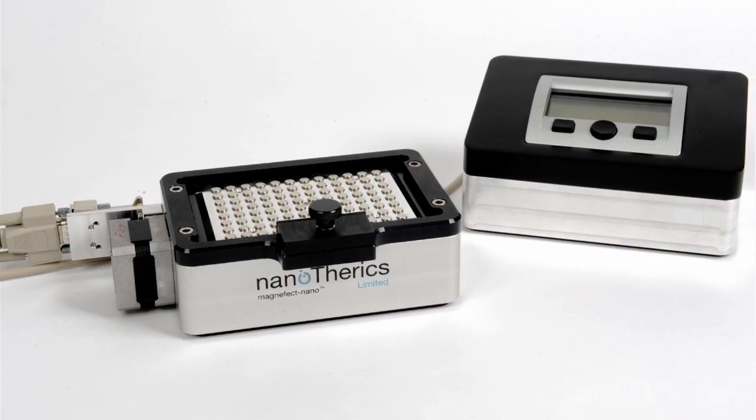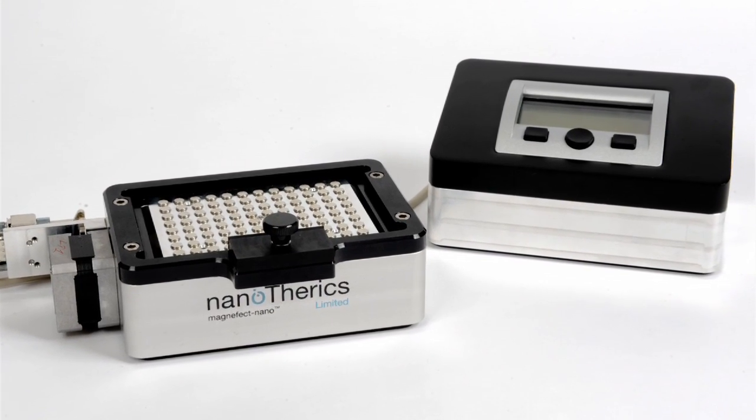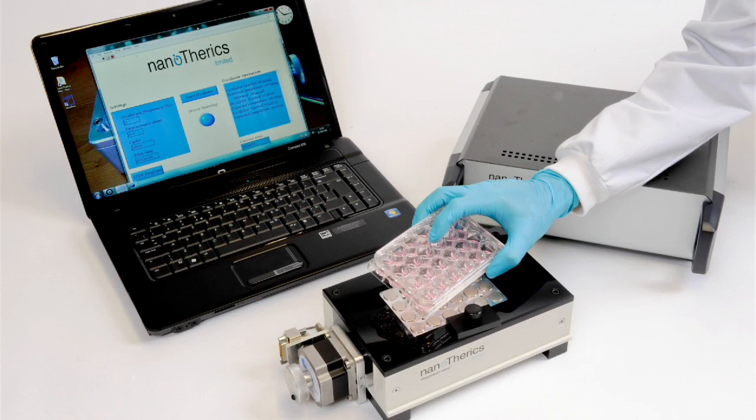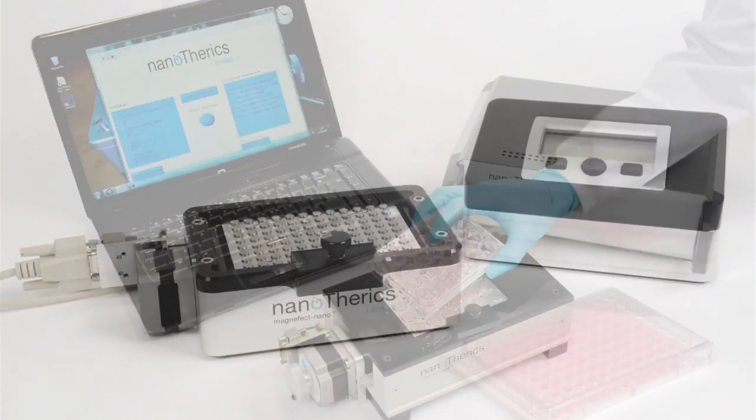The Magnifect Nano from Nanotherics is a full feature, fully flexible, easy to handle, fast and efficient cell transfection device.